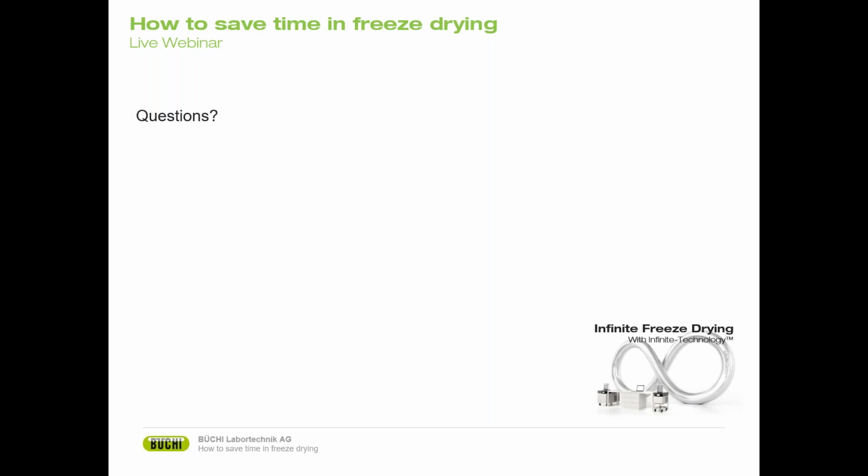Then I have another question for Ulrike. Why is it even needed to heat the sample with shelves? And what happens if there are no shelf heaters available?